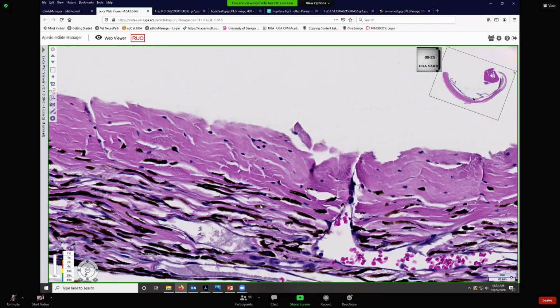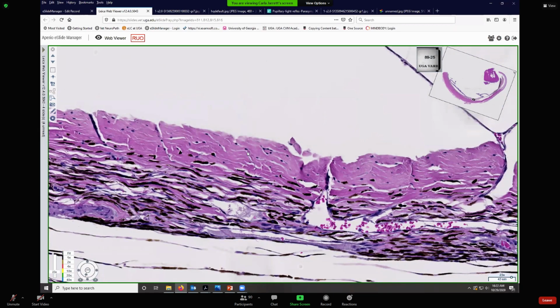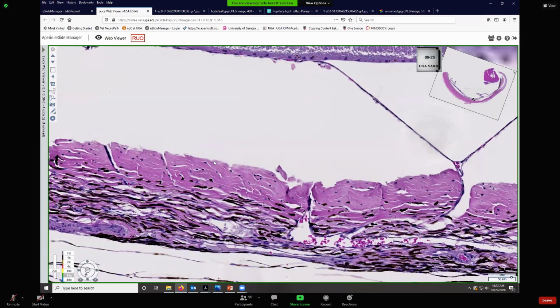Here's a lot of melanin pigment here. But here we don't have that melanin pigment as much, and we just got these really wide, flat sheets of collagen. This is a fibrous, hence collagen fibers. So not cellular, not bricks, but collagen fibers. That is a fibrous tapetum.